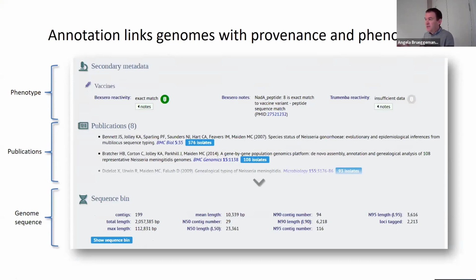The way that's stored in the database is very much like an Excel table, just a column for each of those fields. But you can imagine if you have some data that's sparse, where you might only have information for a few hundred out of tens of thousands of records in the database, it's quite wasteful to create a separate field within the table. And in fact, there are limits to how many columns you can put in a database table.